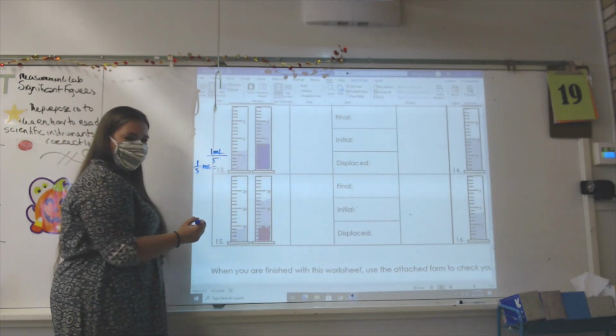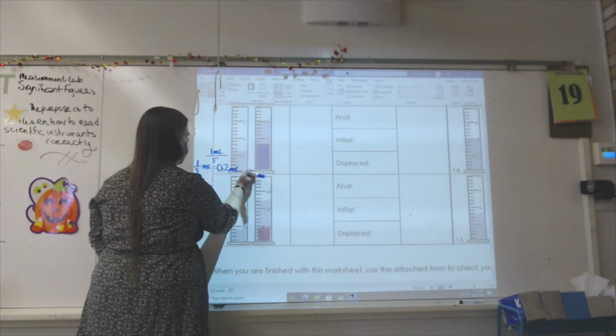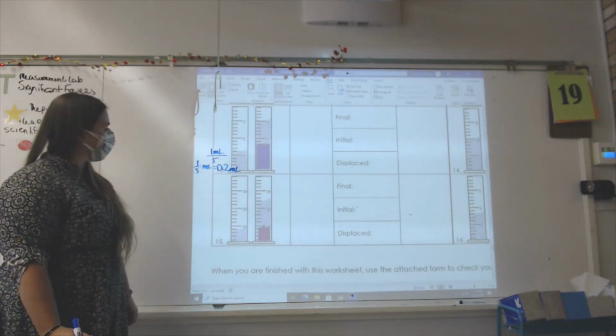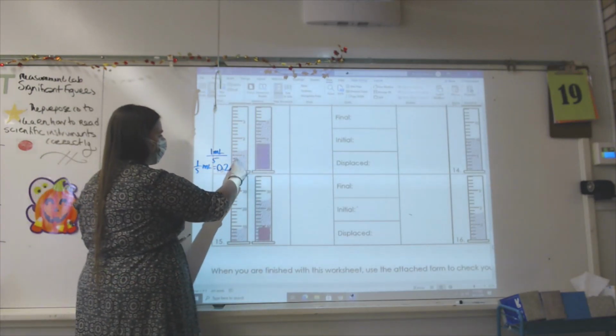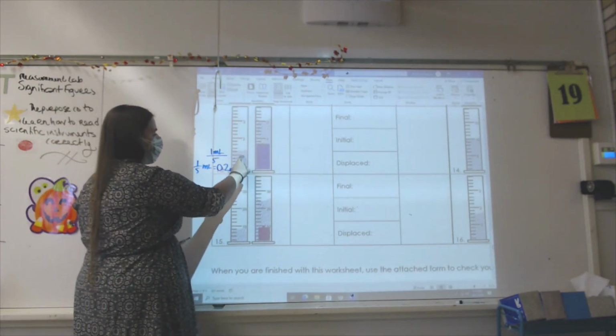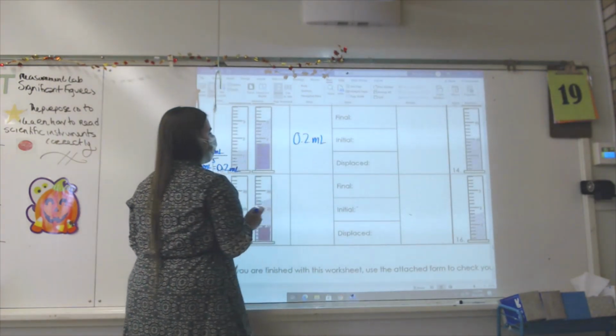Well, we are 8th graders and we're scared of fractions. In this case here, it makes more sense to turn that into a decimal. Each tick mark is exactly 0.2 milliliters. 0.2, 0.4, 0.6, 0.8, 1 milliliter. Each tick mark has an increment of 0.2 milliliters.